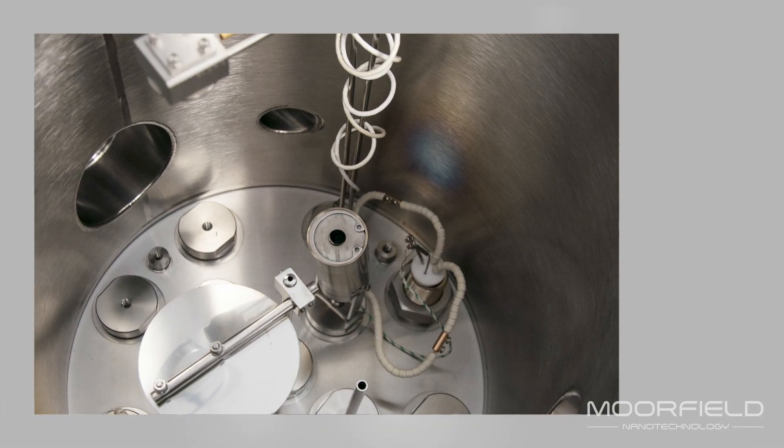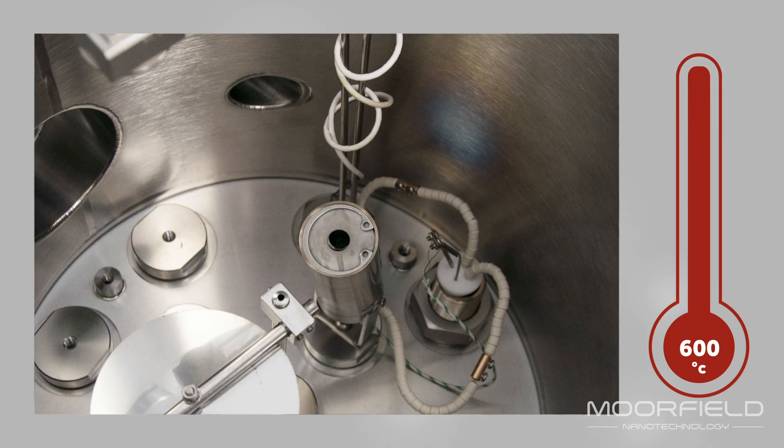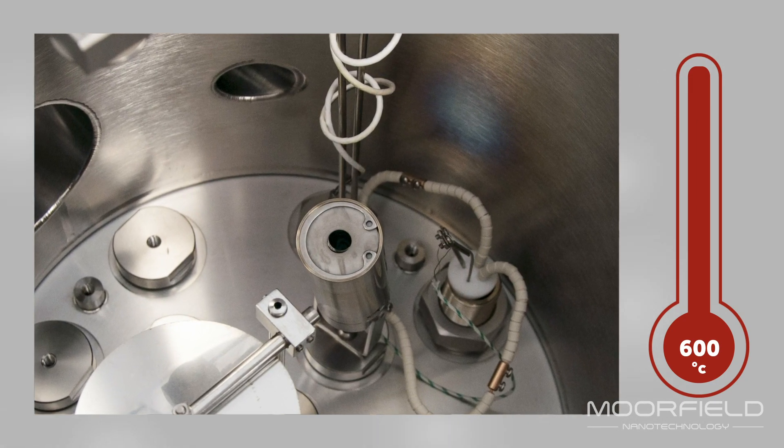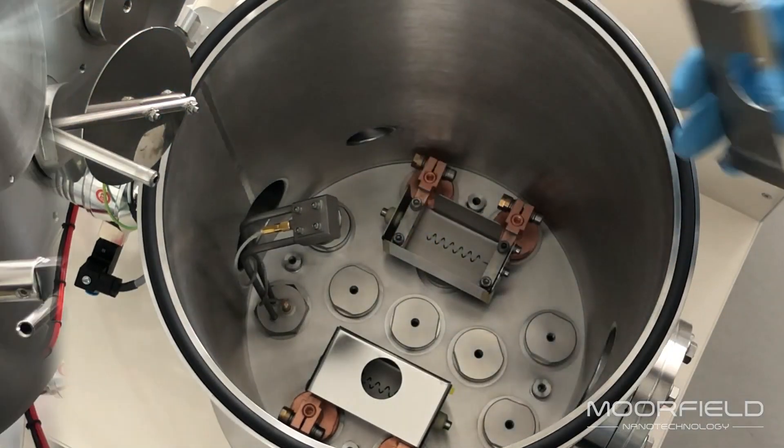For organics, specially designed low-temperature evaporation cells have crucibles and wound filaments that allow for deposition of volatile materials at temperatures up to 600 degrees Celsius. Changing source elements and replacing deposition materials are straightforward.